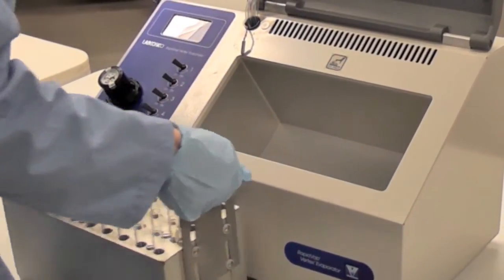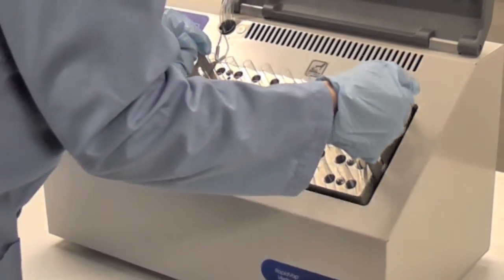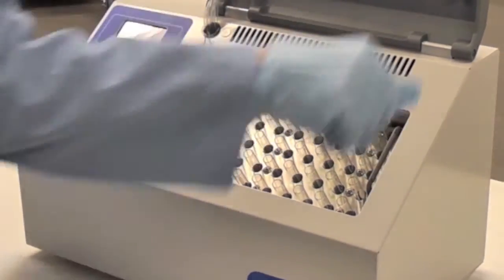The Vertex speeds evaporation of up to 50 samples at one time and uses a dry heat block versus a water bath.